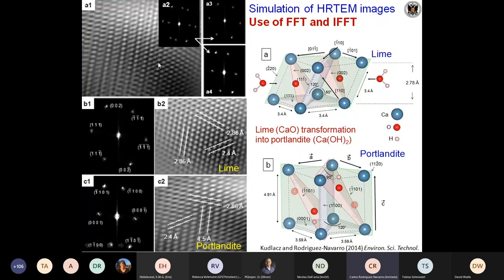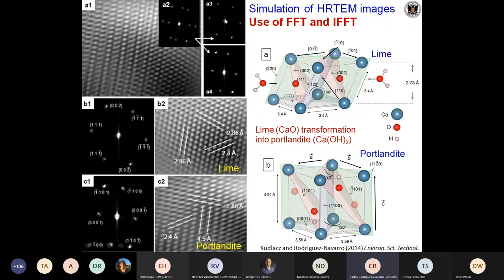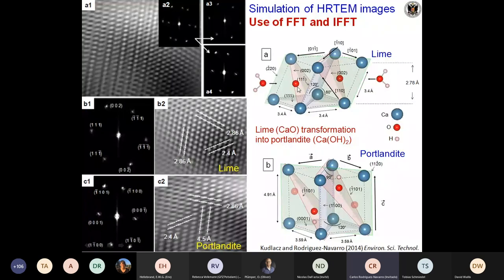We can also simulate using the fast Fourier transform — collecting an image, doing the FFT to get the simulated electron diffraction pattern, decomposing that pattern into different sections for different phases, and then using an inverse fast Fourier transform to simulate the high-resolution pattern of the different phases. This is shown for the transformation of lime into portlandite — we have the coexistence of both phases, and we can identify and separate one from the other.